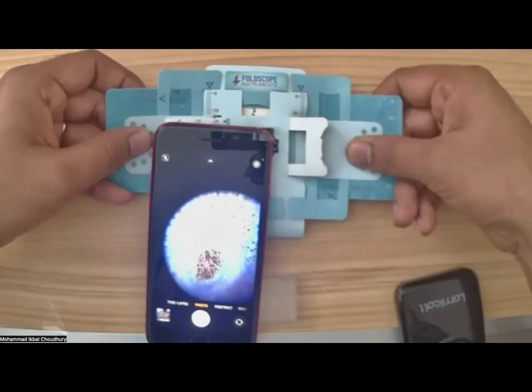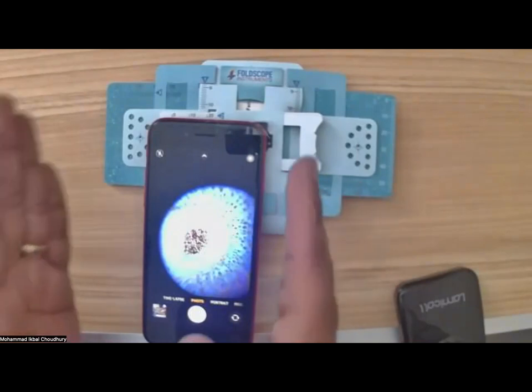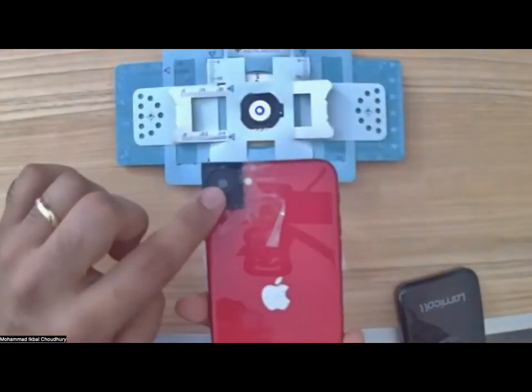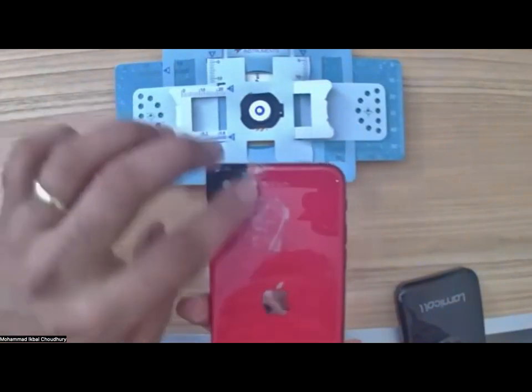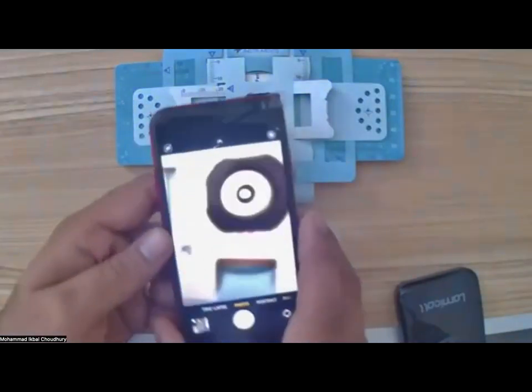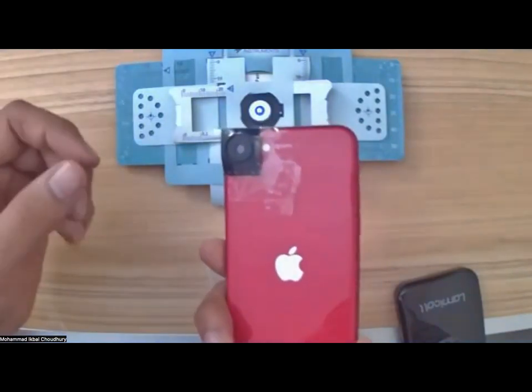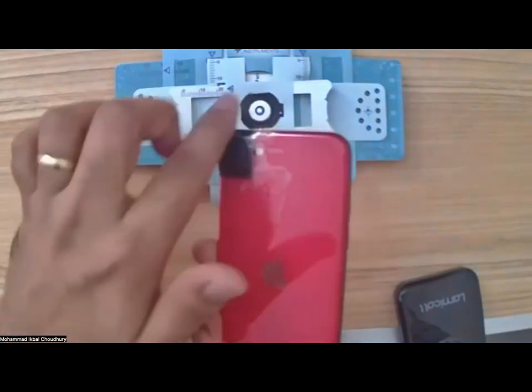So this whole field of view is eccentrically placed on my camera screen, right? And the reason is I didn't spend enough time connecting this. So connecting that is what is causing this issue. This whole magnetic adapter connection is, I think, the rate limiting step here, which causes good image versus bad image. So once you connect this properly, right at the center, I can redo it again, do a bit of trial and error until I have finalized the correct position, and then I do a good taping so that it's there.